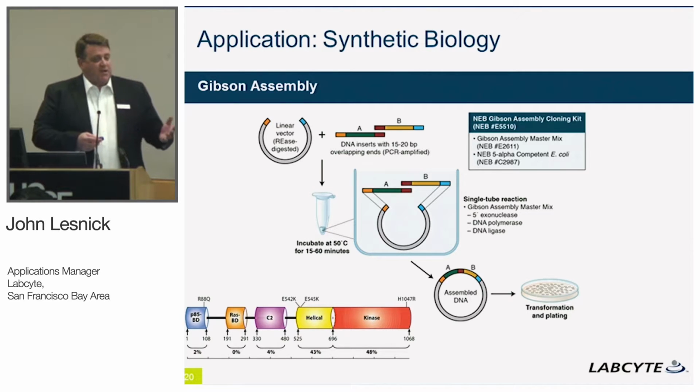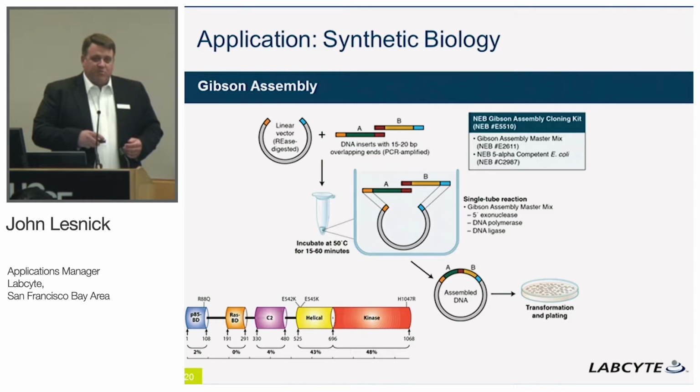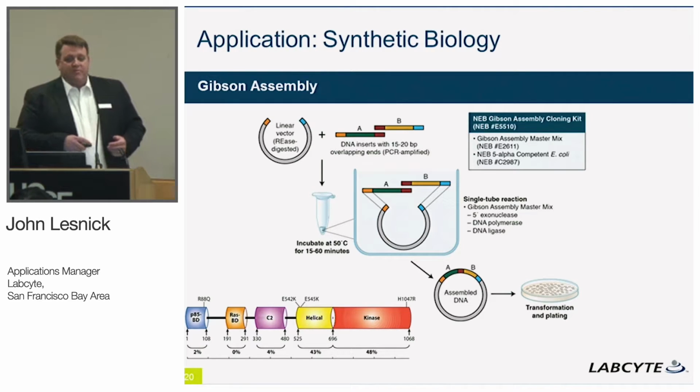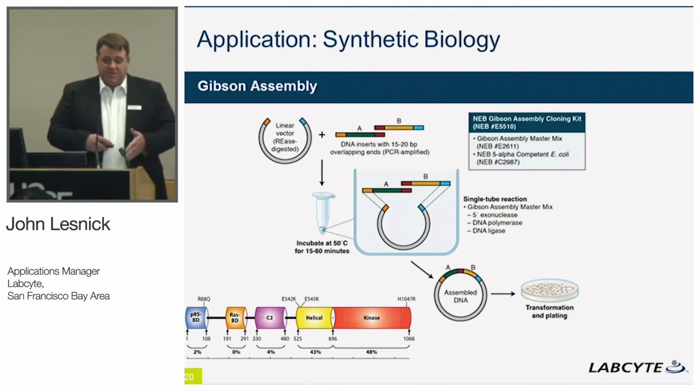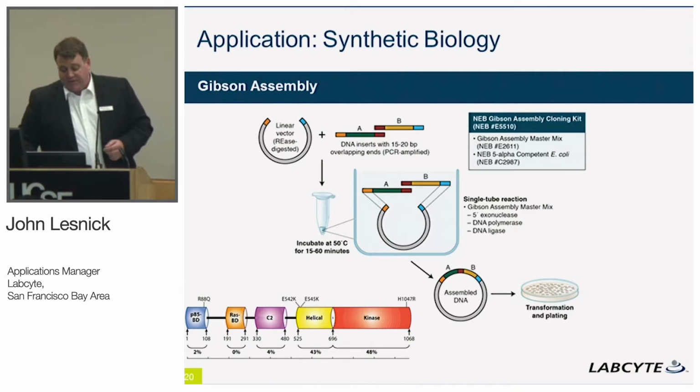You can test a biochemical assay for inhibition. You can even transform and create new cell lines. So utilizing the Gibson assembly, it gives you a lot of versatility. And thinking about the AML study where they had the massive amounts of mutations, this might be one route where you can pick and choose which are the most important mutations to look at. Of course, it depends on if it's a particular gene of interest or multiple mutations with a gene, but it's a fast way to help prioritize potential work.